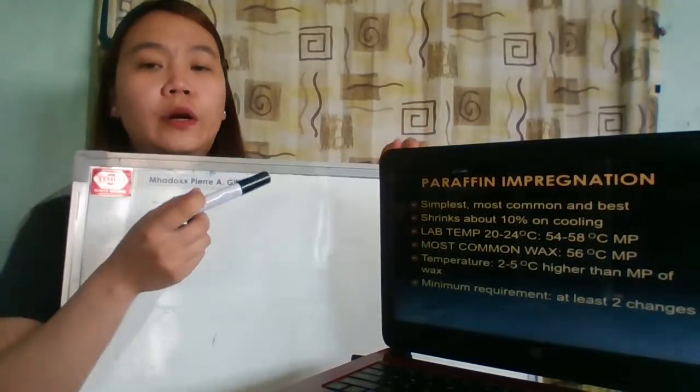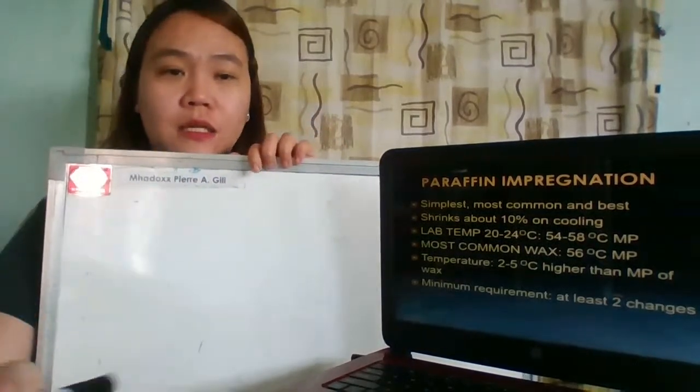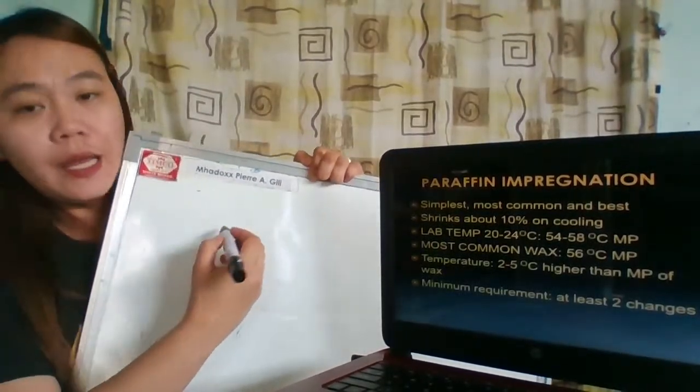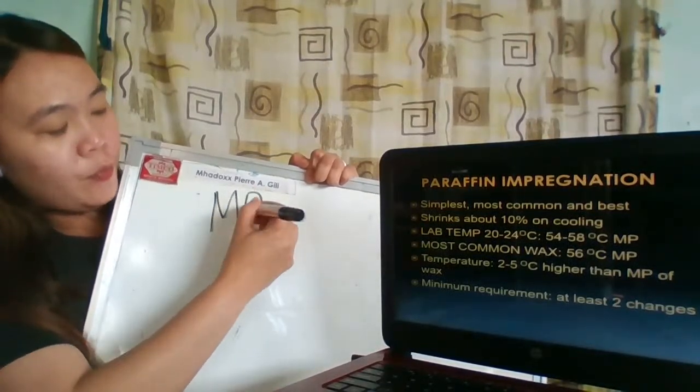I have a very large whiteboard, so it is very difficult for me to write. So common waxes which are utilized in the laboratory would have the following melting points.